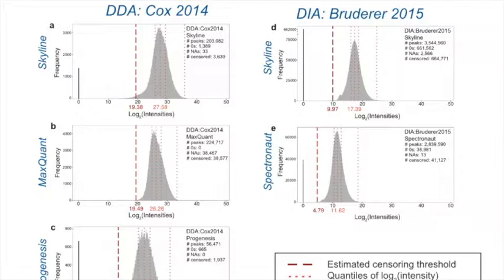So now, yes, just pick up. Sorry? That's hard to tell. In Skyline, they're not the same, for the reasons I just explained: NA means overlapped peak, 0 means low abundant peak. But in other tools, it's not always documented, so it's really hard to know. If somebody tells us, we're happy to take it into account, but sometimes it's really difficult.